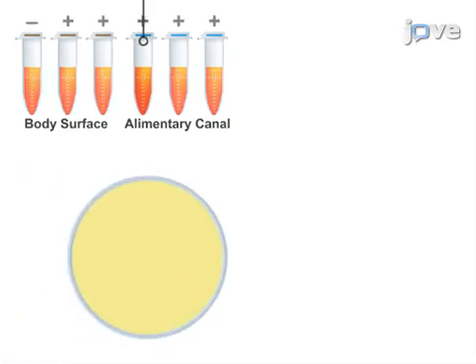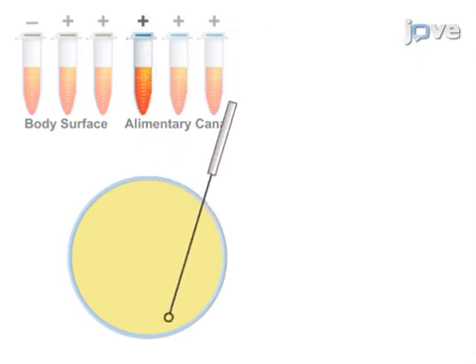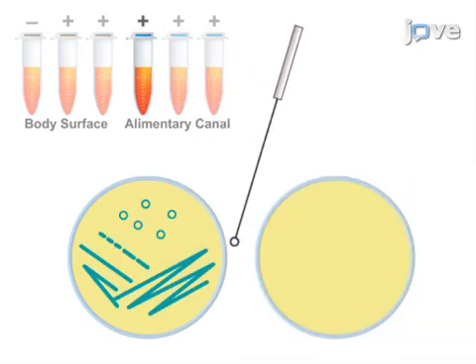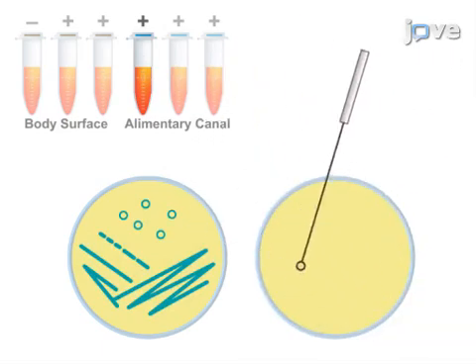The final step is to isolate pure bacterial colonies from the samples that were PCR-positive by plating the enrichment broth on selective and differential media.